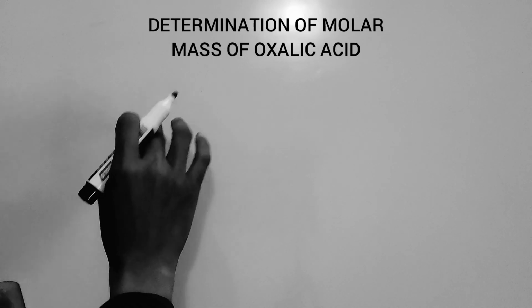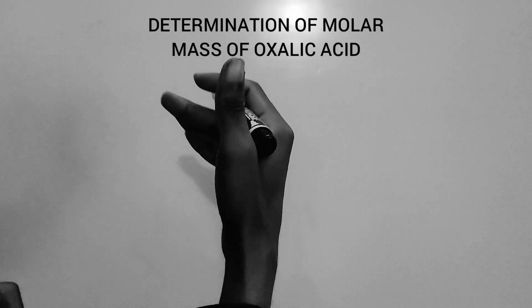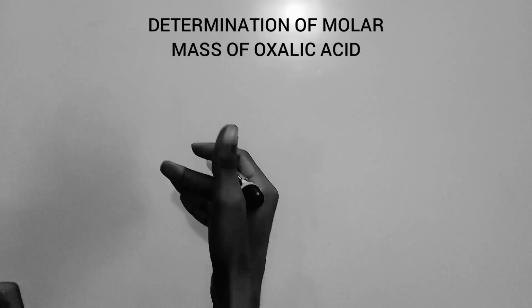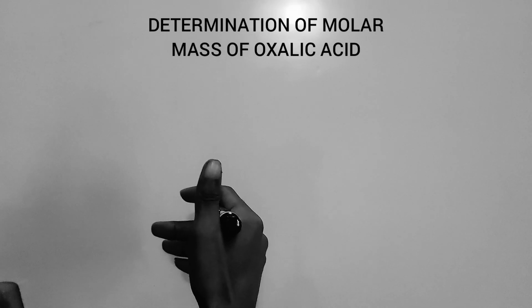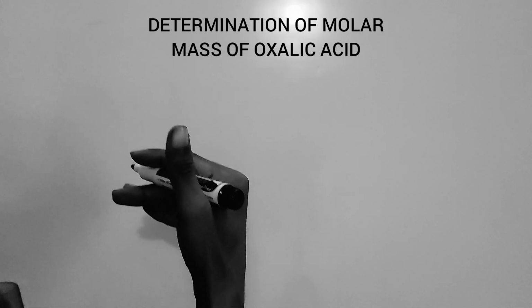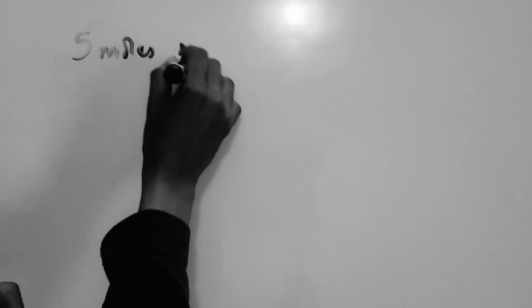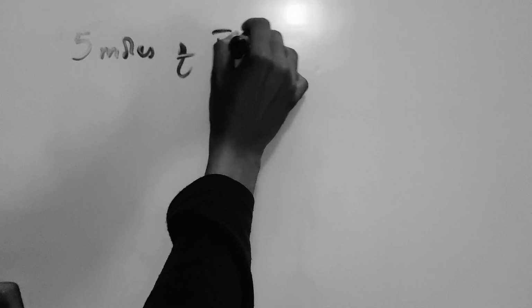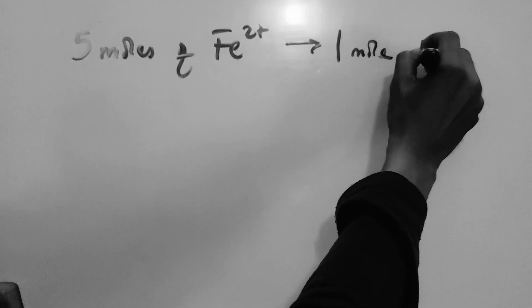So what this means is that standardizing the potassium permanganate with the iron would help you to find the exact molarity of solution B, which is the permanganate, meaning that your second table is where your calculation is going to start. In that case, if you check your redox reaction, you get to see that 5 moles of iron 2 required 1 mole of the permanganate.